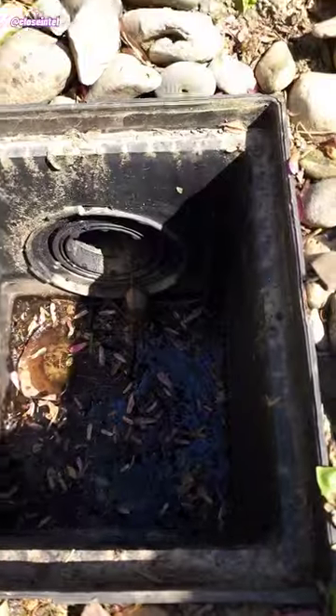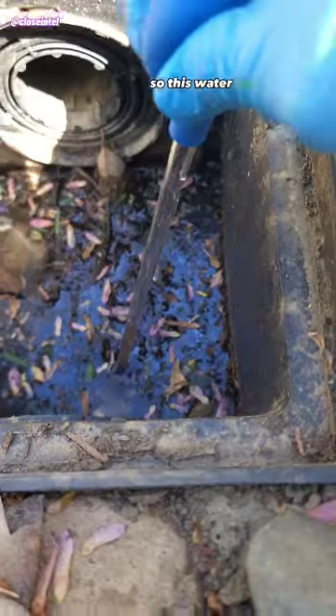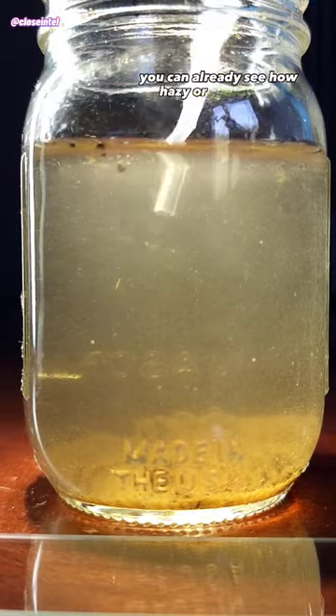Today I'm going to show you what's in this outdoor sump pump water under the microscope. It hasn't rained in a while, so this water has just been sitting stagnant and growing all kinds of microbes. After letting it settle, you can already see how hazy or cloudy the water is, and that's from all the microorganisms inside.